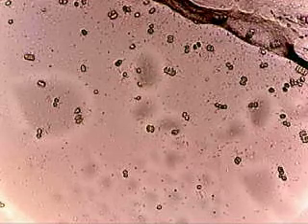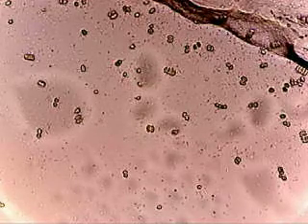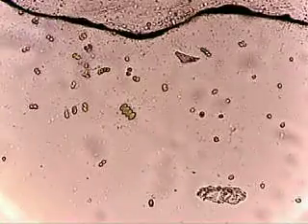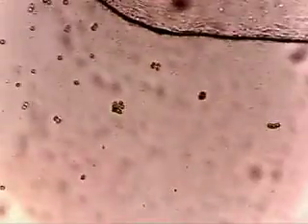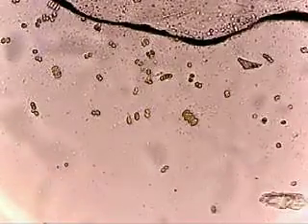Okay, moving on, you'll notice, of course, there are two mixed types of organism, the blue-green algae and the faster-moving spirochetes. Notice the sheer number of those singular blue-green algae.